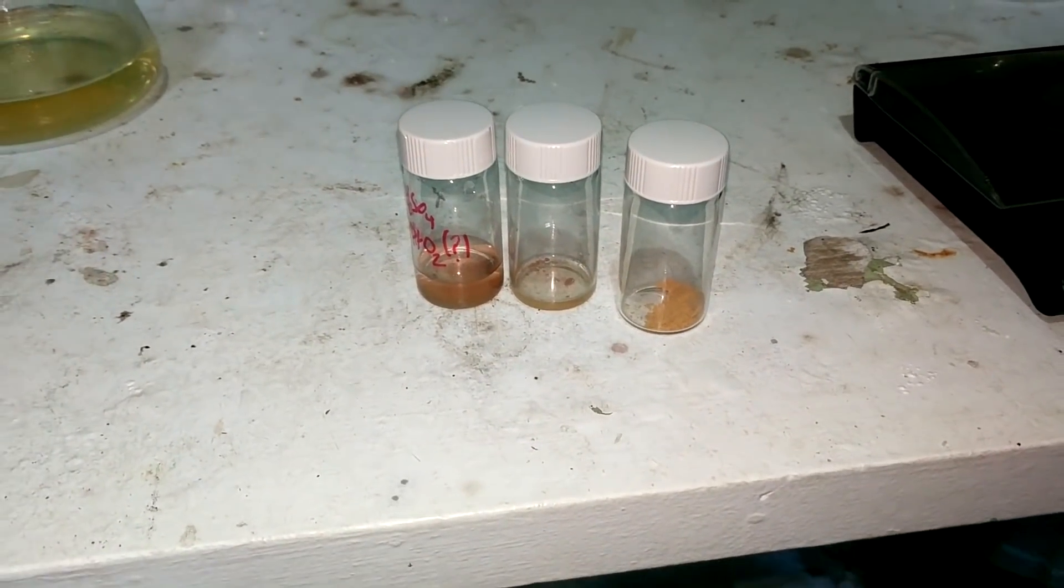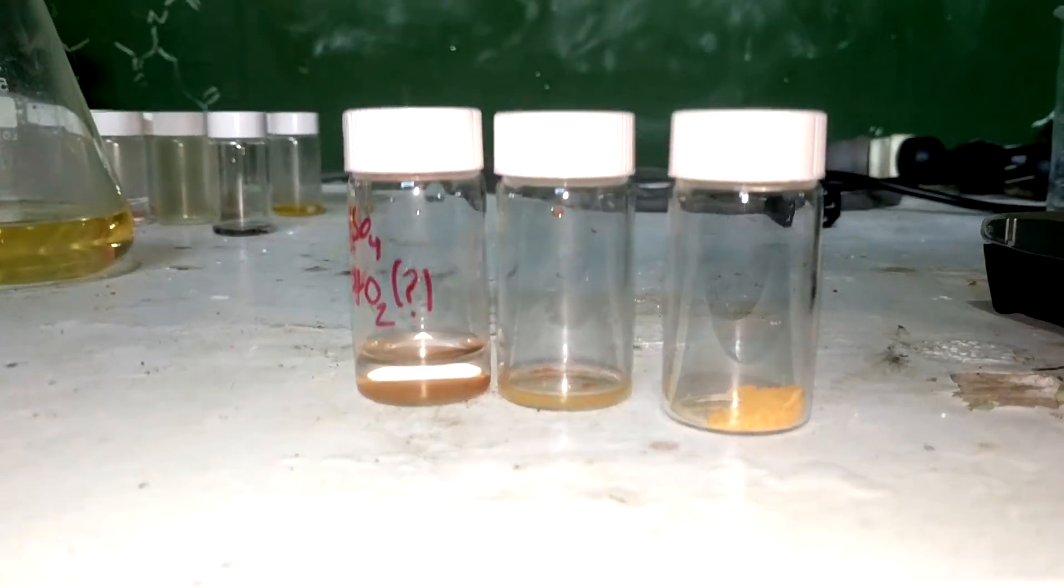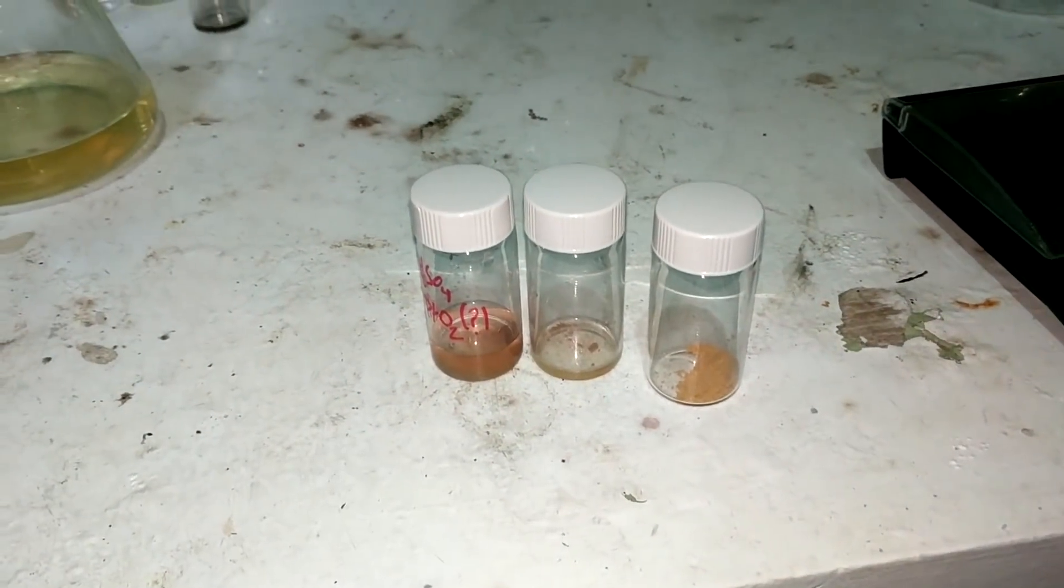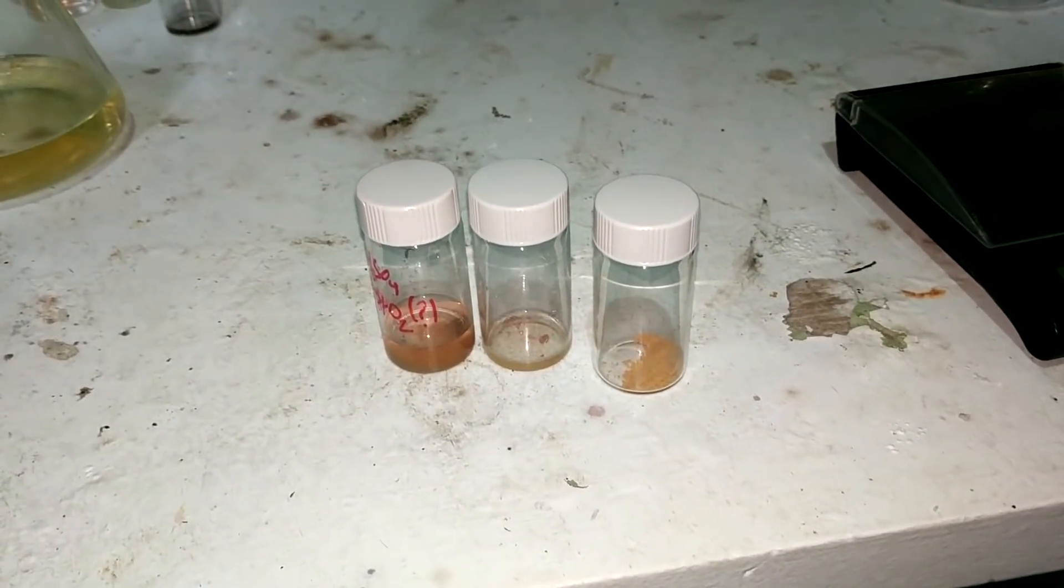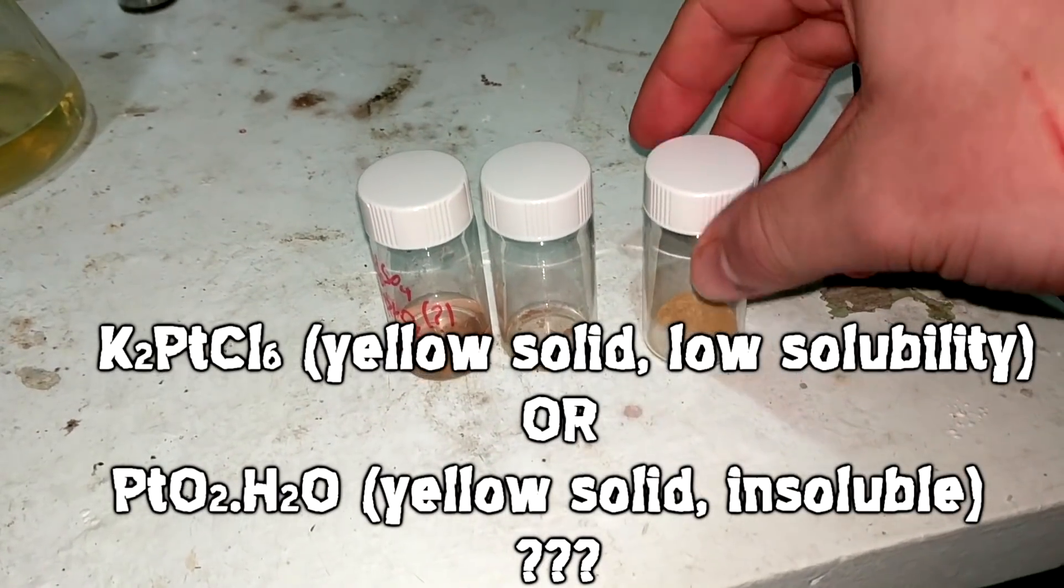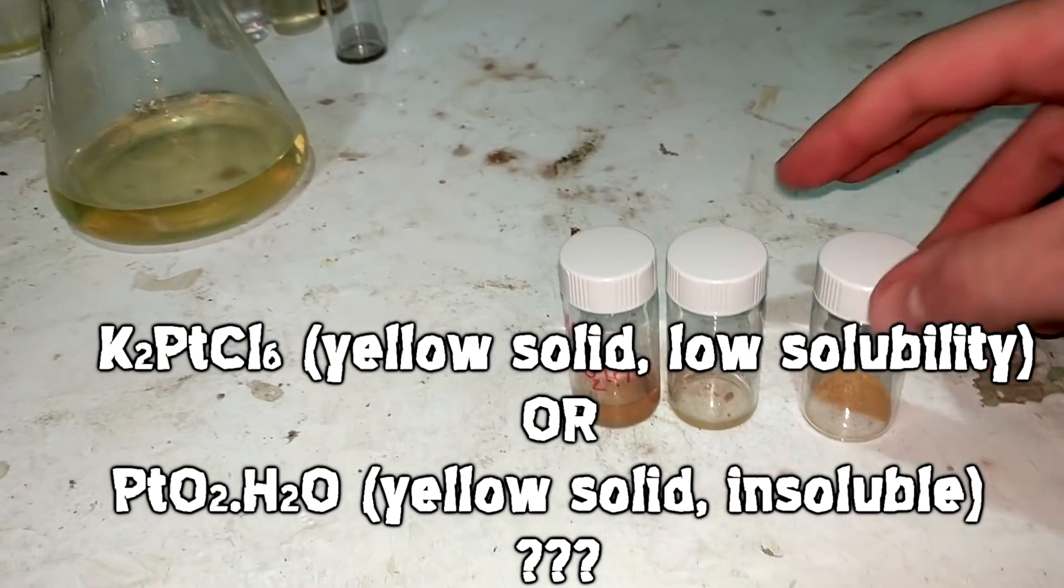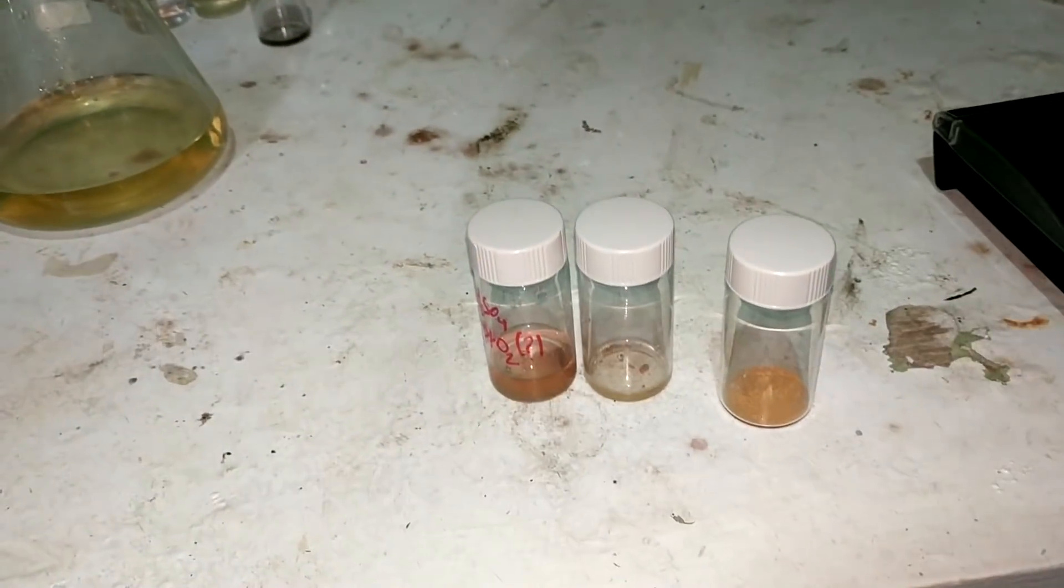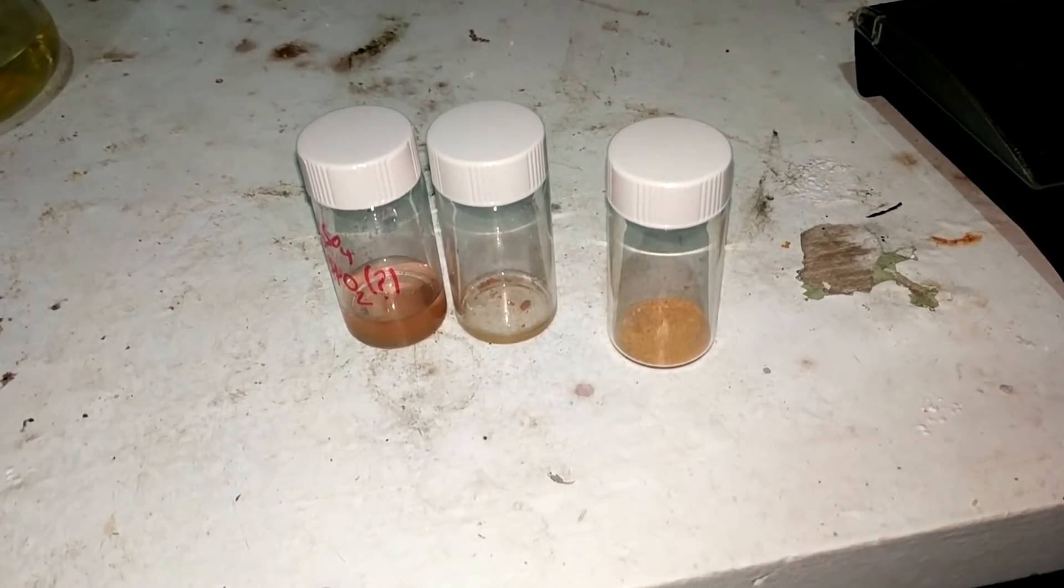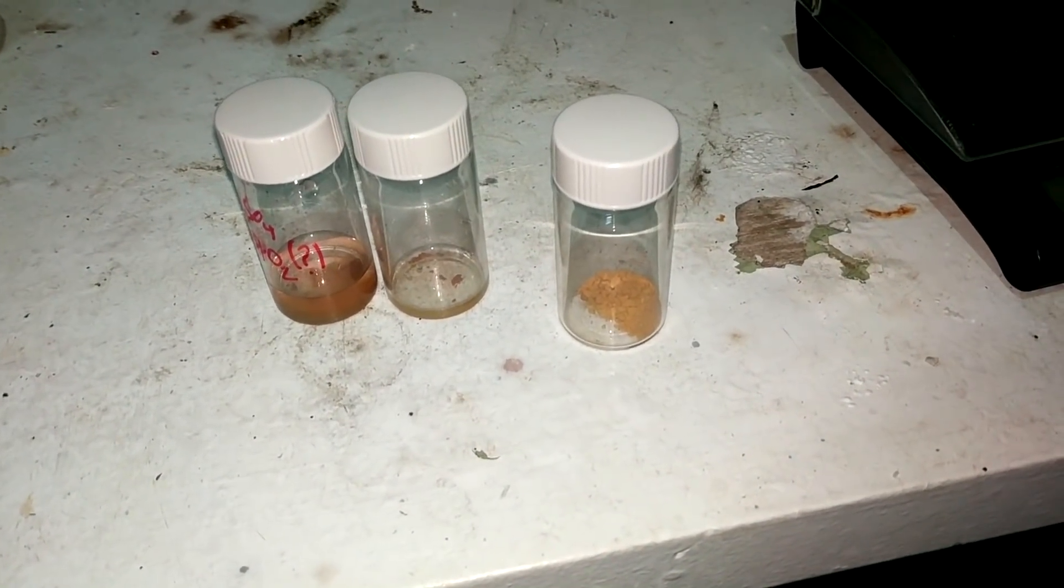All right that was meant to be the final shot of the video. It was going to dissolve in the acid everything was going to be good but it didn't dissolve in the acids at all. It just formed a suspension in both sulfuric and nitric acid which leads me to believe it's not platinum oxide at all. It's potassium hexachloroplatinic acid which is quite insoluble in water. So what we have isn't actually platinum oxide, it's just the potassium salt of the chloroplatinic acid which is very annoying. But what we can do is take this and heat it with some more potassium nitrate. I'm fucking fed up with this.